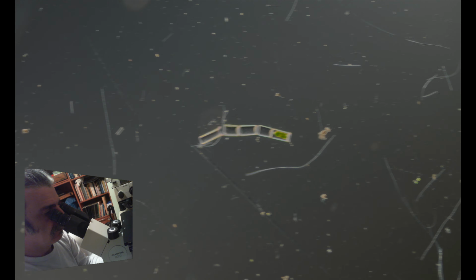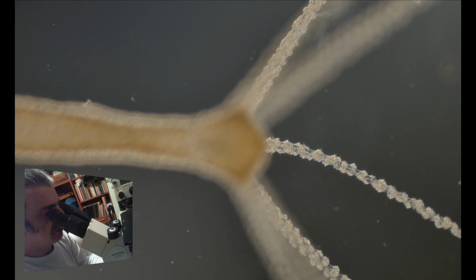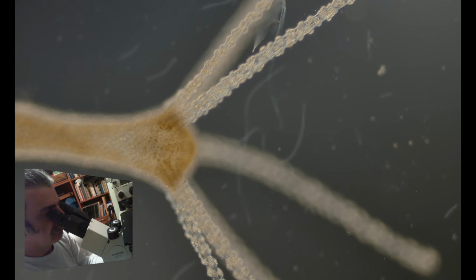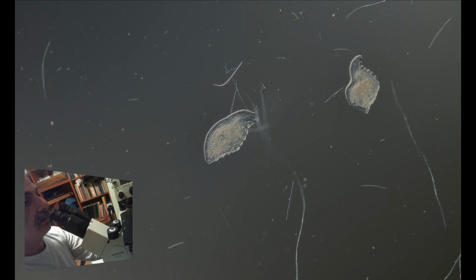Stentor, hydra. Hydra. Oh, two very nice Loxophyllum.